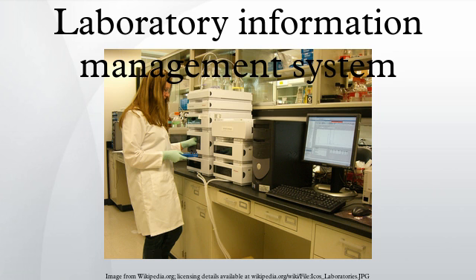From 1996 to 2002, additional functionality was included in LIMS, from wireless networking capabilities and georeferencing of samples, to the adoption of XML standards and the development of Internet purchasing. As of 2012, some LIMS have added additional characteristics that continue to shape how LIMS is defined. Examples include the addition of clinical functionality, electronic laboratory notebook functionality, as well as a rise in the software as a service distribution model.